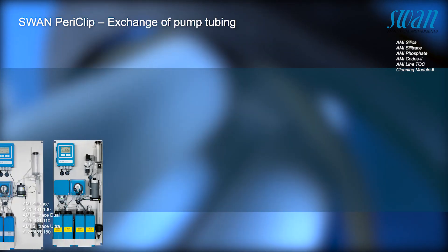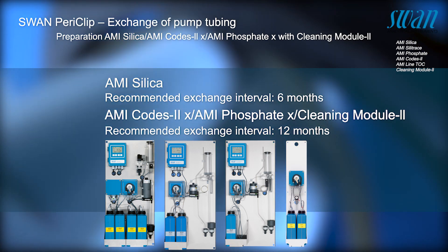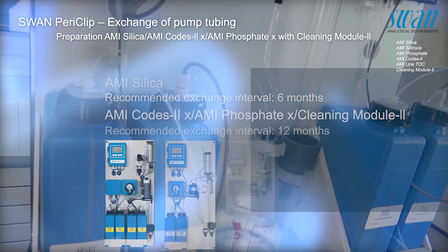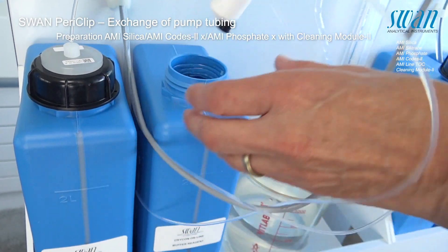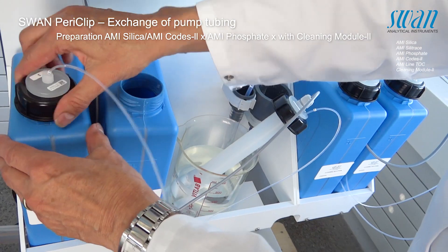The following tubes and tube sets are available. Place the suction lances in a bucket with demineralized water.